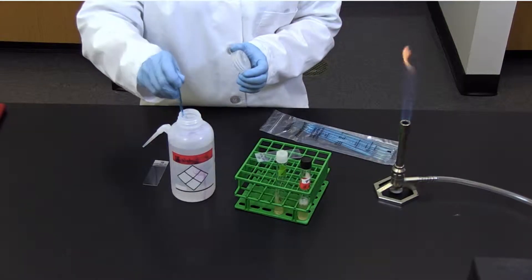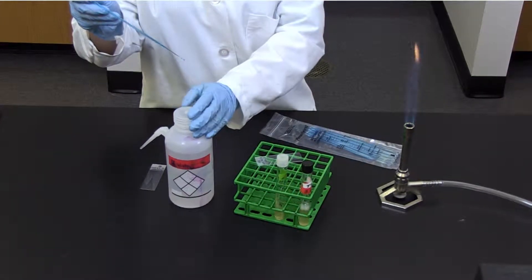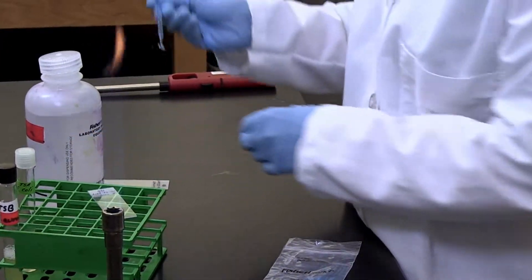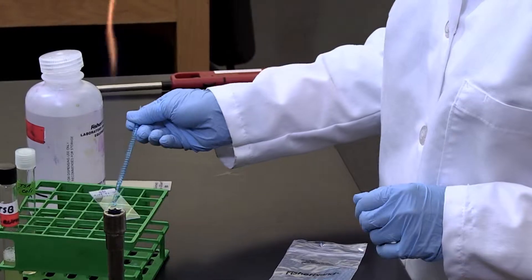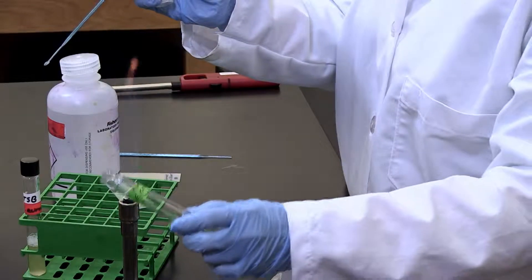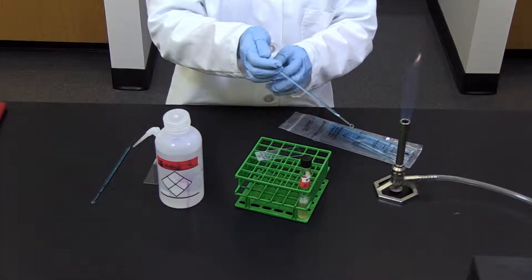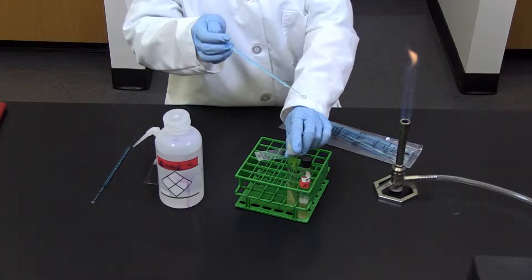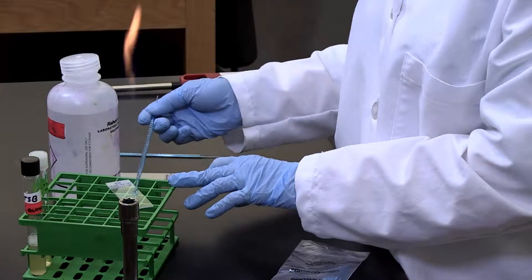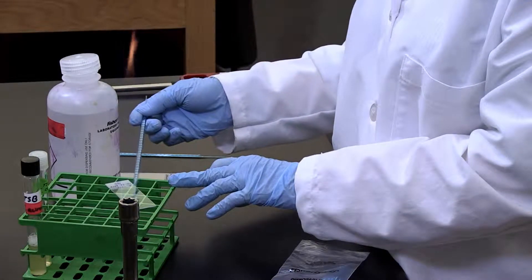Second, place enough deionized water to fill an inoculating loop, we'll call this a loop full, on the center of the slide. Third, use an inoculating needle to aseptically add a minute amount of bacterial growth to the water. Spread the bacterial suspension over the center of the slide, covering an area about the size of a quarter.